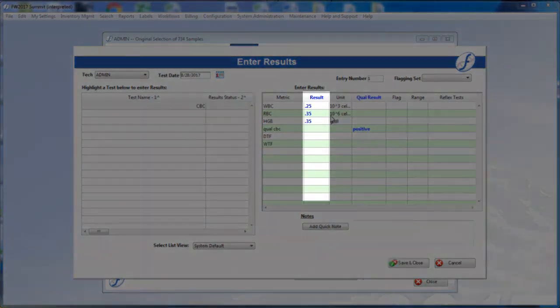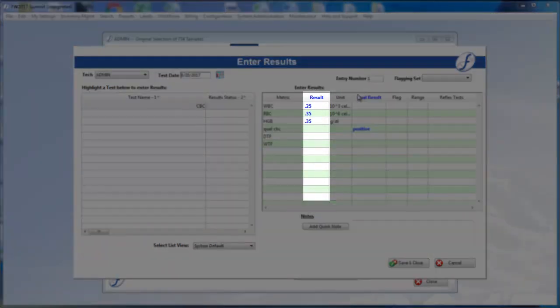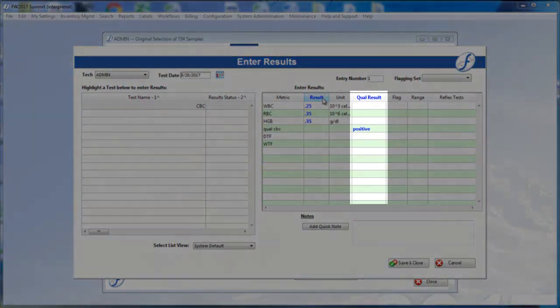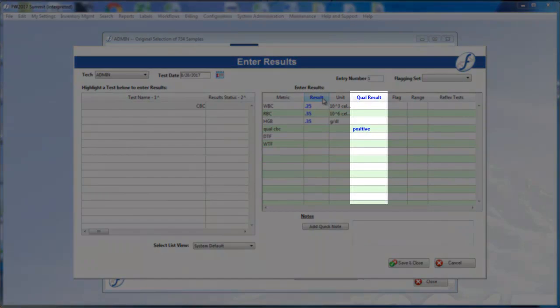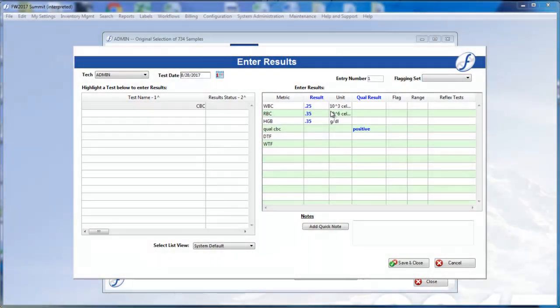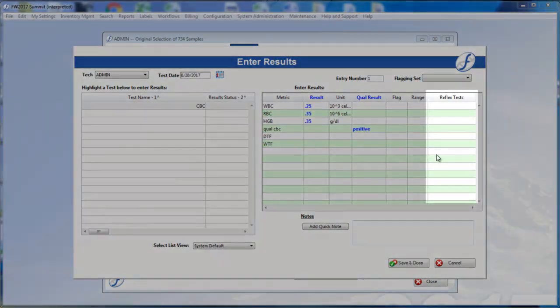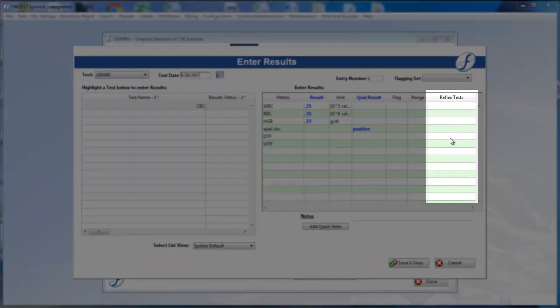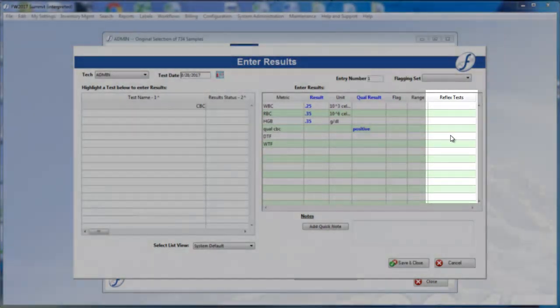The result column is for quantitative results, and the qual result column is for qualitative results. Any reflex tests that get triggered will display in the corresponding column.